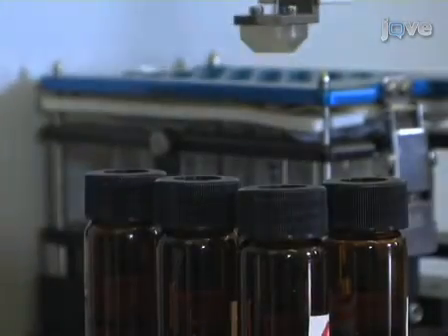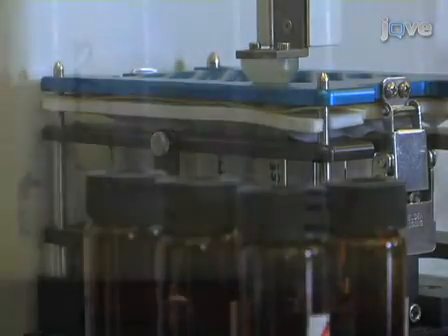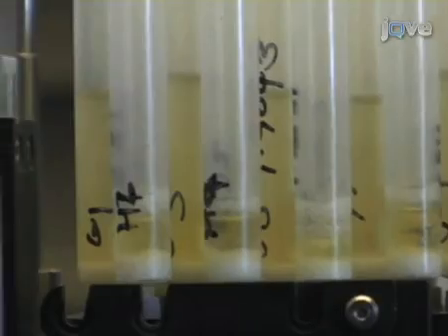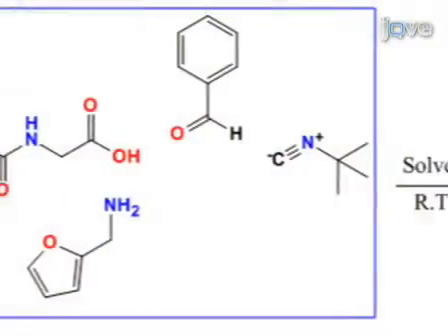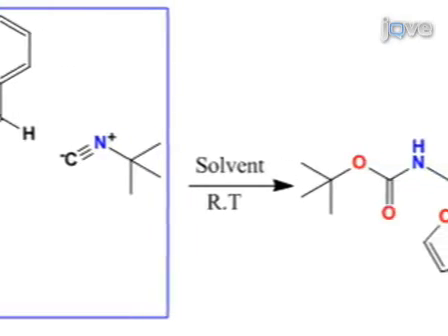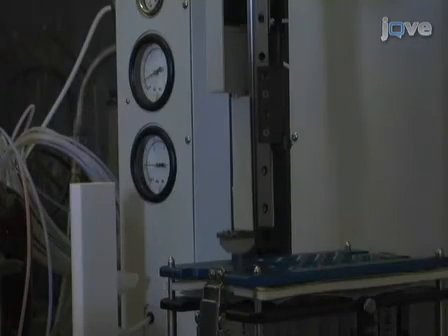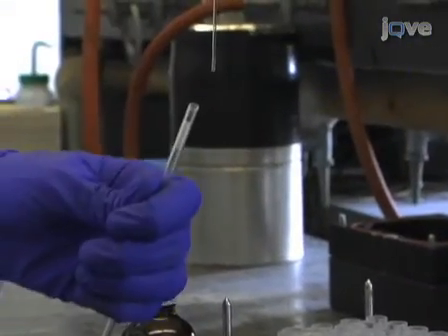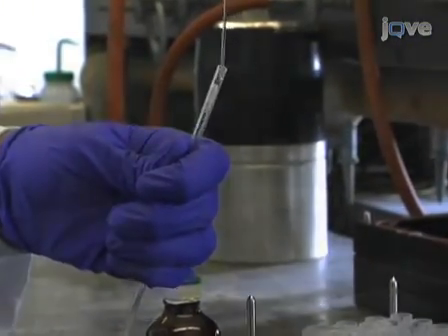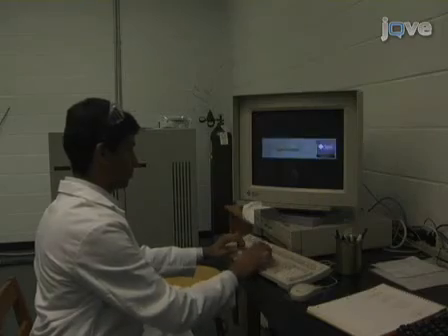The big difference between running a reaction in a round bottom flask and performing it in parallel is that it allows the organic chemist to ask new questions and challenge assumptions in a systematic way. Adding automated liquid handling into the equation frees up the chemist to spend more time thinking about the project at a high level and less on the details of every experimental run.